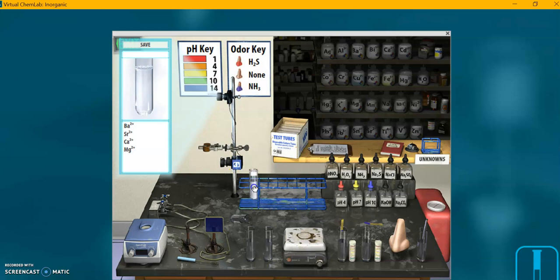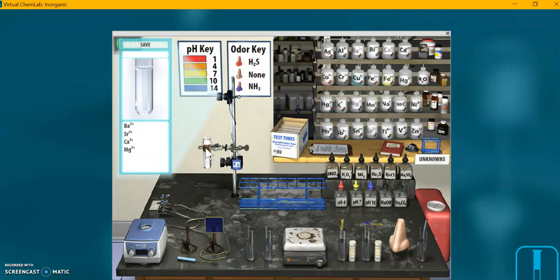Notice when I, as soon as I mouse over all the chemicals over here are listed. I'm going to put it back in the stand. And now I want to go over a couple of things with you that are not explicitly mentioned in the worksheet that you'll need to know.